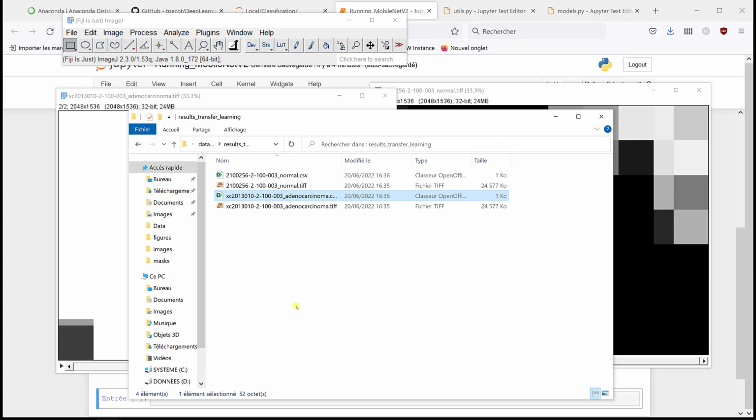Even though I made a few tests, and it seems that using the pre-trained model and just sticking to the last layer leads to better results. But we could have more epochs, and definitely we could do some data augmentation as well, and it should improve the performance. And we'll see that in the next training.